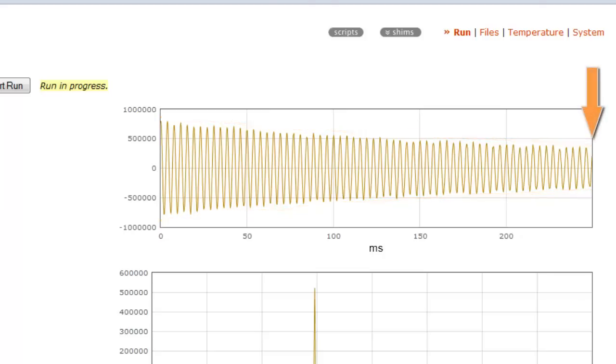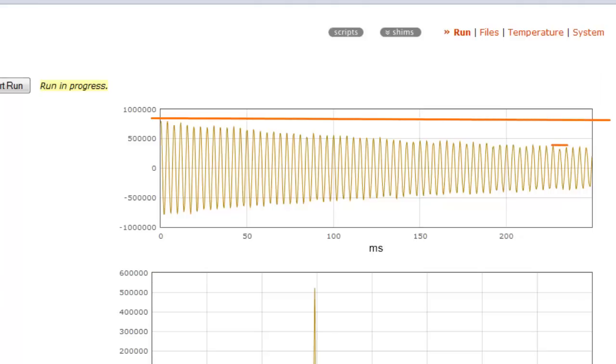We can see in our FID that at 250 milliseconds, we still have about 50% of our signal intensity. The more signal intensity we have, the better is our shim. And that is what we're trying to achieve when we shim.